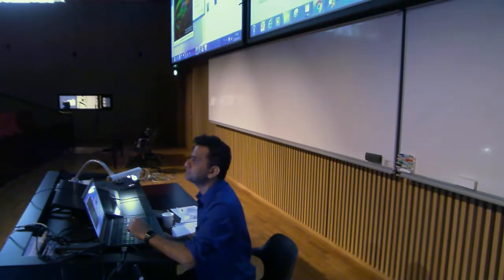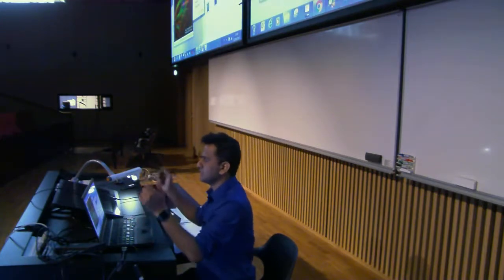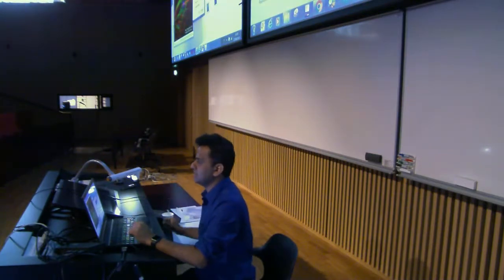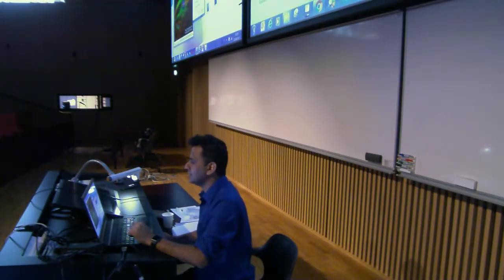Okay. Yes? How do you make that scale bar wide? Wide? I think side. Oh, you mean wide means the horizontal? Okay, yeah, of course. So that's the length basically. You see here? So I can go to 30. No. Oh, you mean the color of the scale bar. White. Oh, white. Okay. So just say overlay.